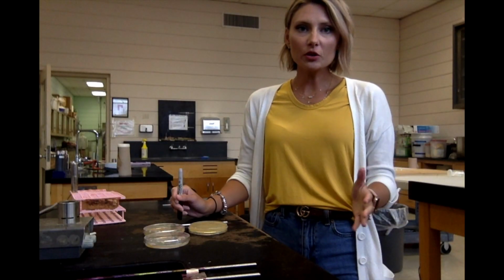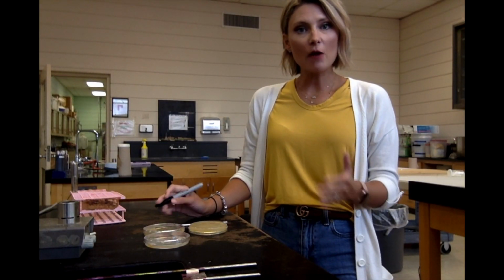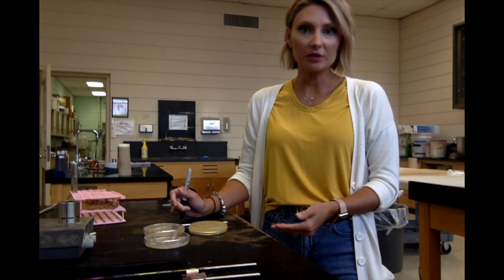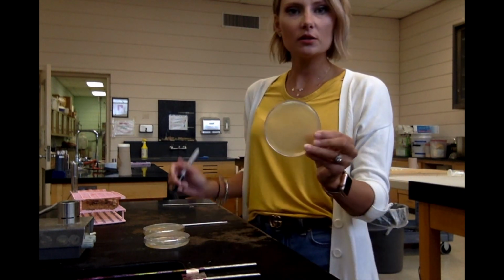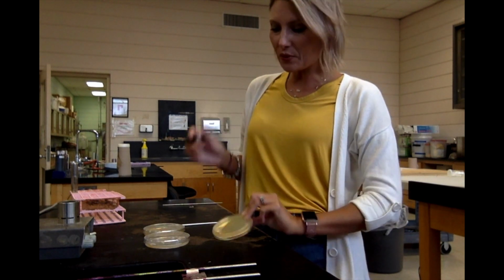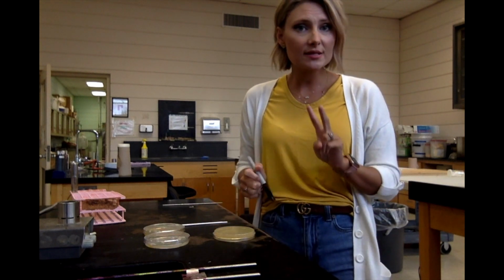All right, so we are over here at the workbench to inoculate our PCA plate, and then I'm going to show you the results of the PDA and the PCA plate. So here's what my PCA plate looks like, okay, and it's just like a yellowy looking color. And so what we're going to do is we're going to choose two places to swab.